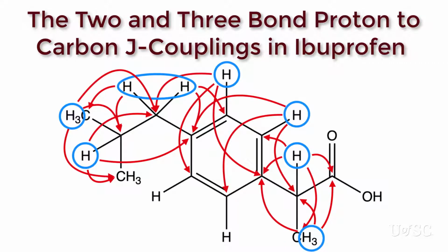Typically, these couplings are over 2 and 3 bonds, but there are some rare cases when 4 and even 5 bond couplings can be seen. As we will see during the interpretation, these correlations can help construct a complete assignment of both the C13 and proton spectra for known structures, or help build structural fragments for unknown samples.